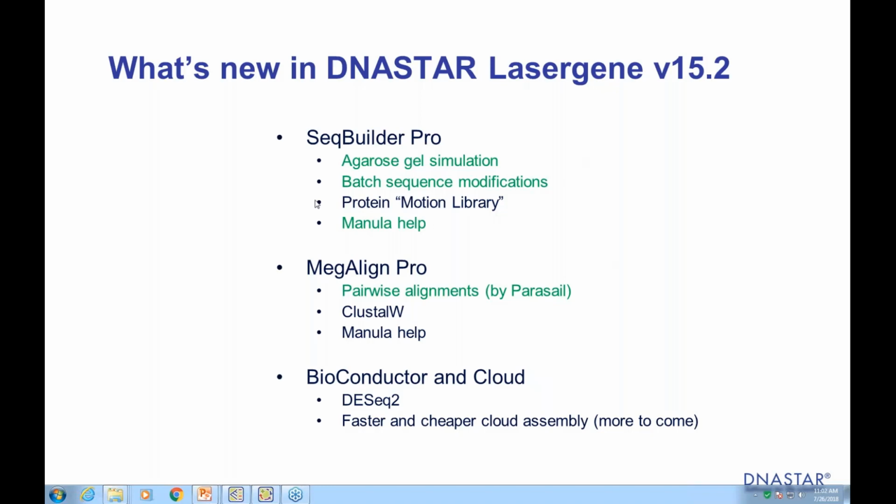I have highlighted in green some things that we'll take a look at, but there are some other features. We have a motion library for proteins accessible through SeqBuilder. We also have a new help system called Manula that integrates tutorials with videos, and it's a really nice way to learn to use the software. So if you haven't looked at the Manula yet, certainly do that.